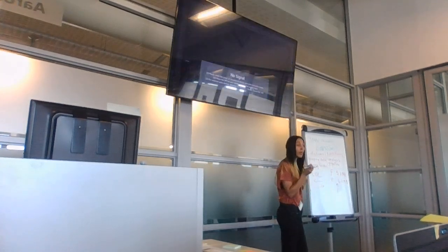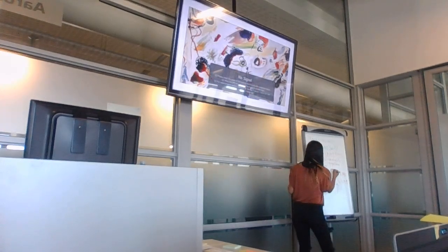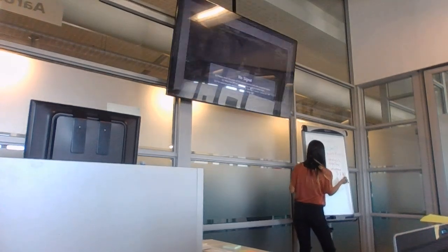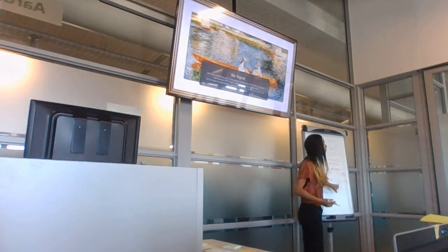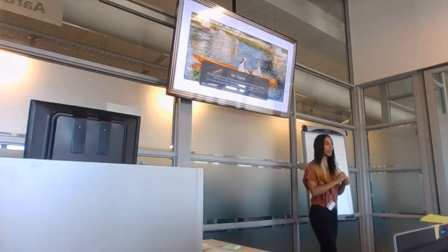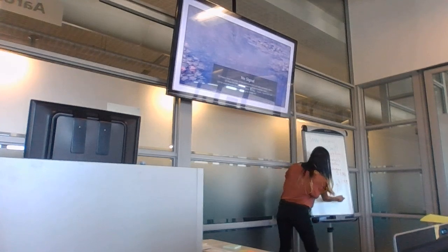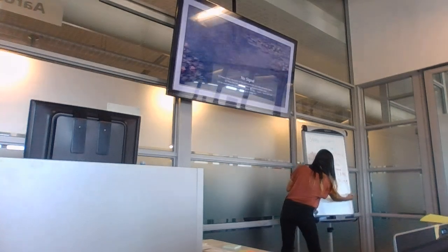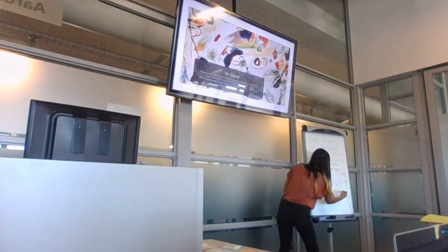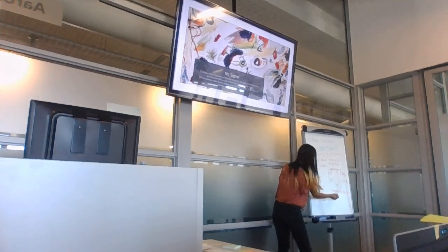Are you asking about the contaminated file? Let me first start just in general. Let's say these were actual Vibrio cholerae files, both of these. This one just has more Vibrio cholerae reads. So basically the reads are stacked, right? Maybe this one has two more over this region. If this is your reference, that's the reference file you're comparing to. These are your reads from your sample, right?